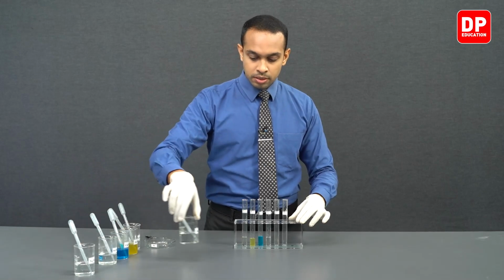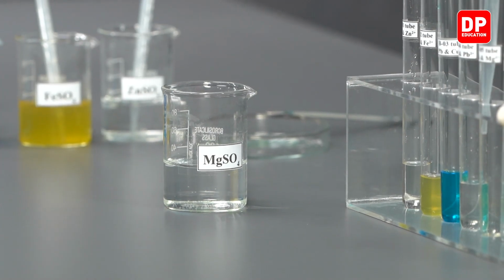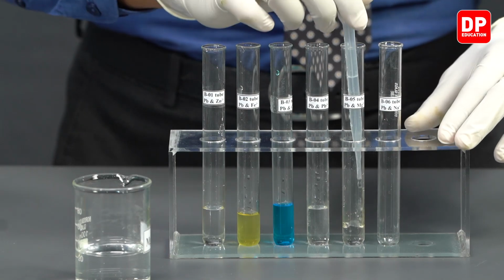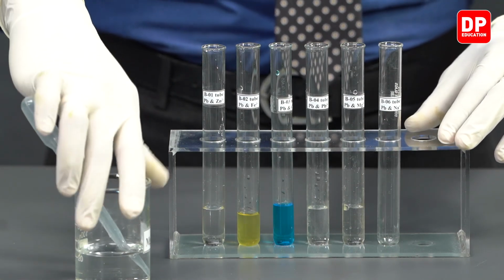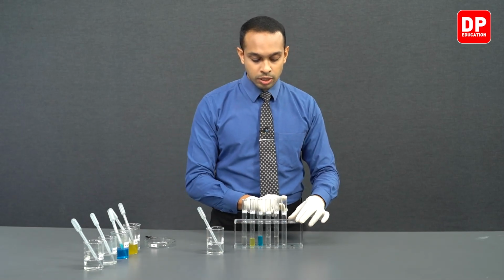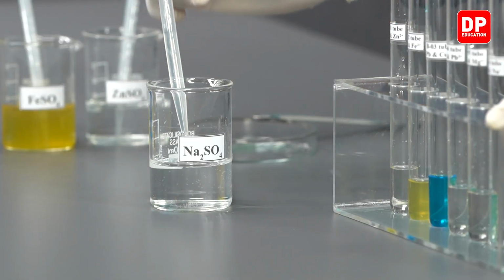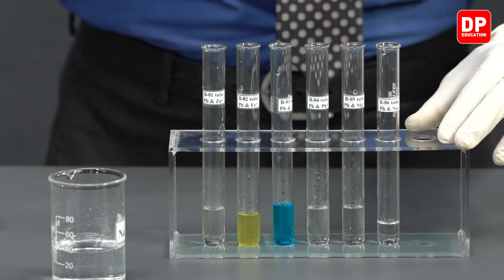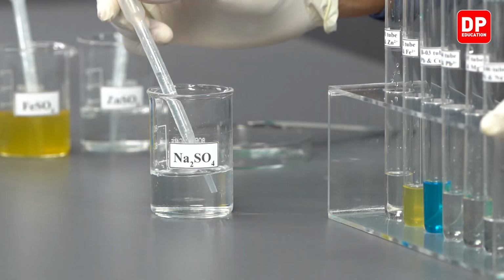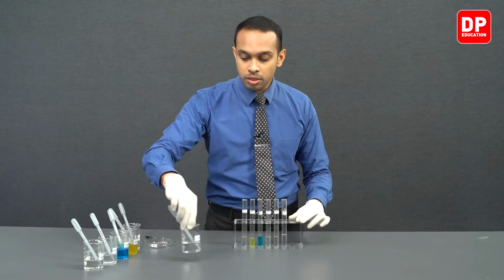And to the test tube labeled Mg2+ or B5, we are adding magnesium sulfate solution. And finally, to the test tube labeled Na+ or B6, we are adding sodium sulfate solution. We are introducing sodium 1+ ions into the medium. We are adding this solution into this test tube so that this test tube contains a solution with sodium 1+ ions.